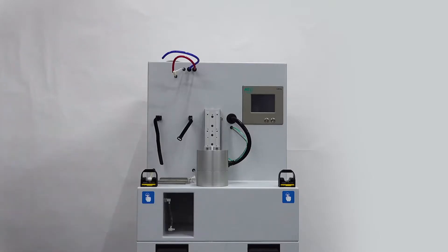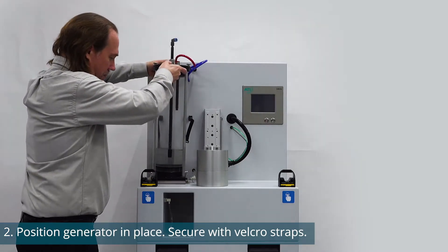Place the generator onto the metal plate. Once secure, strap the generator in place using the Velcro straps.